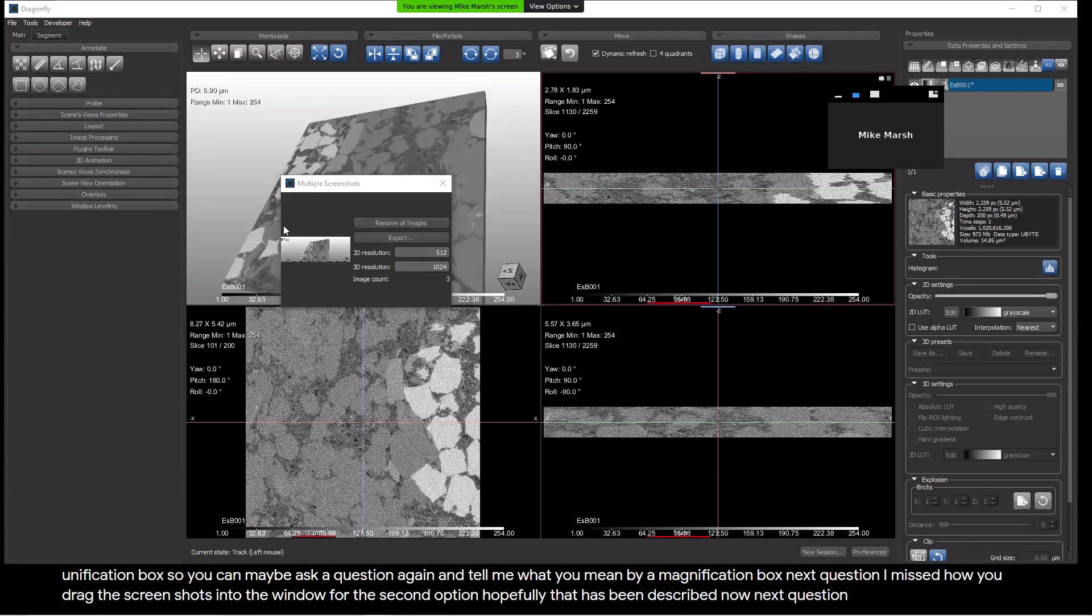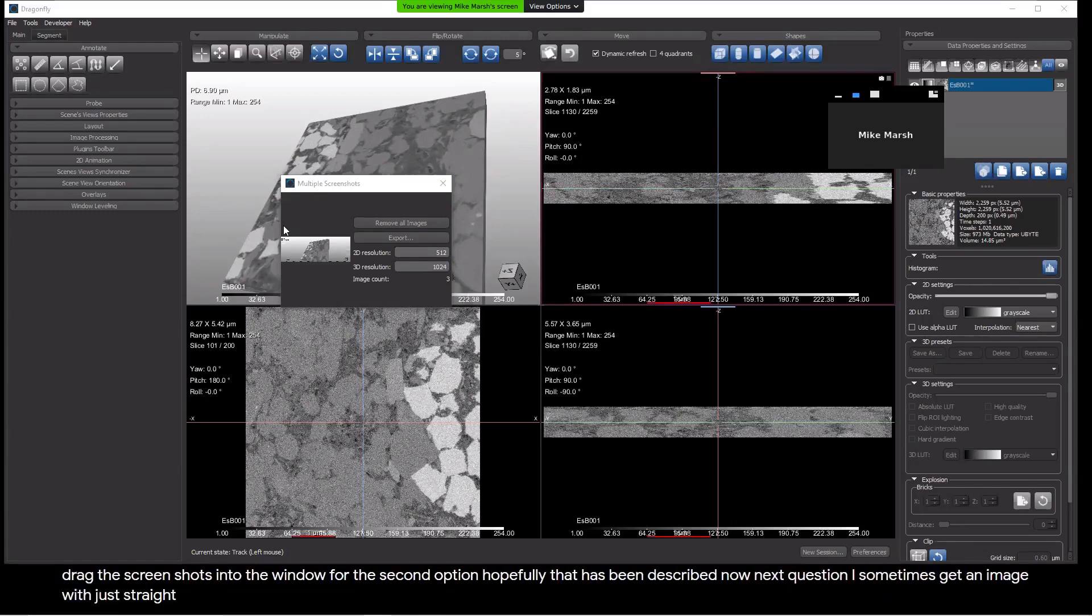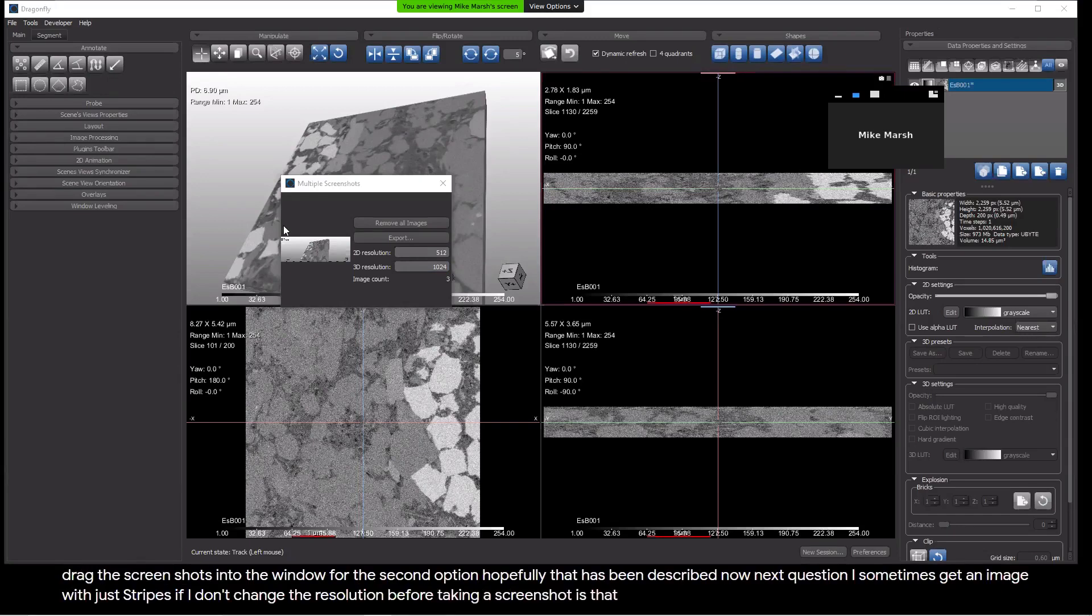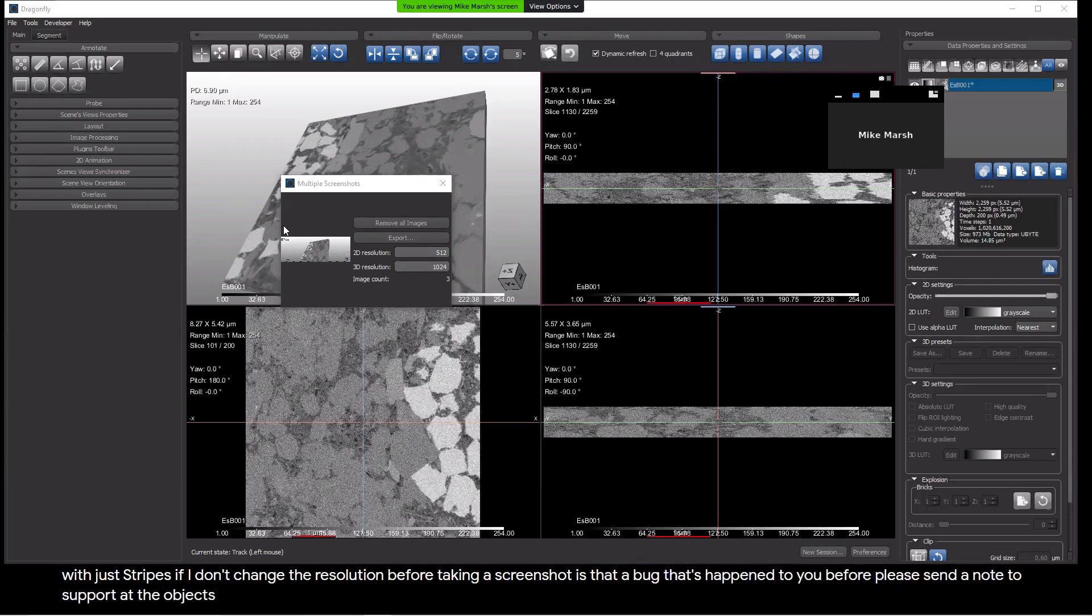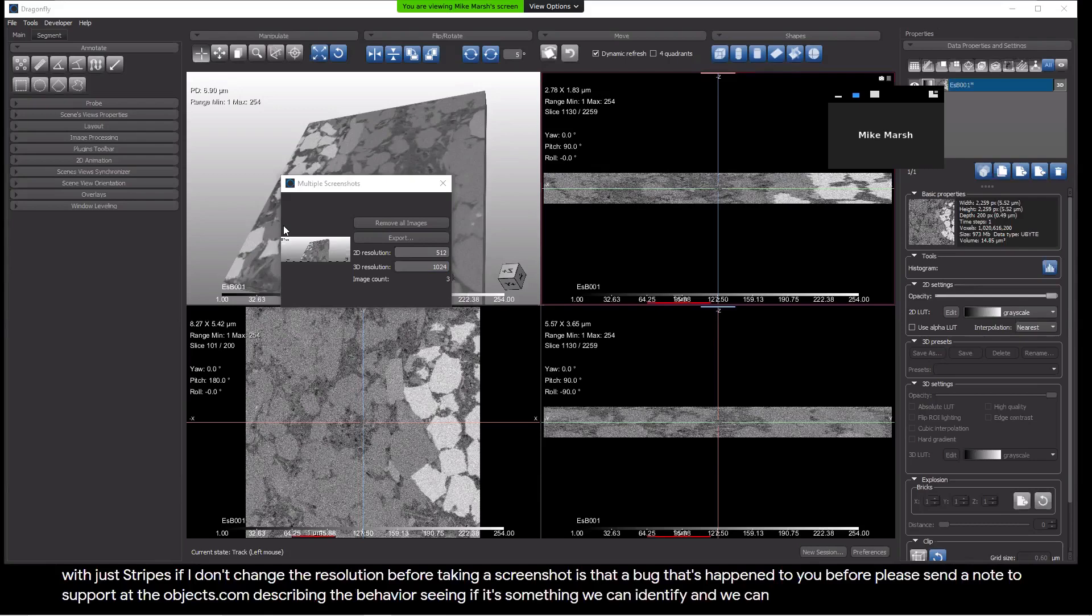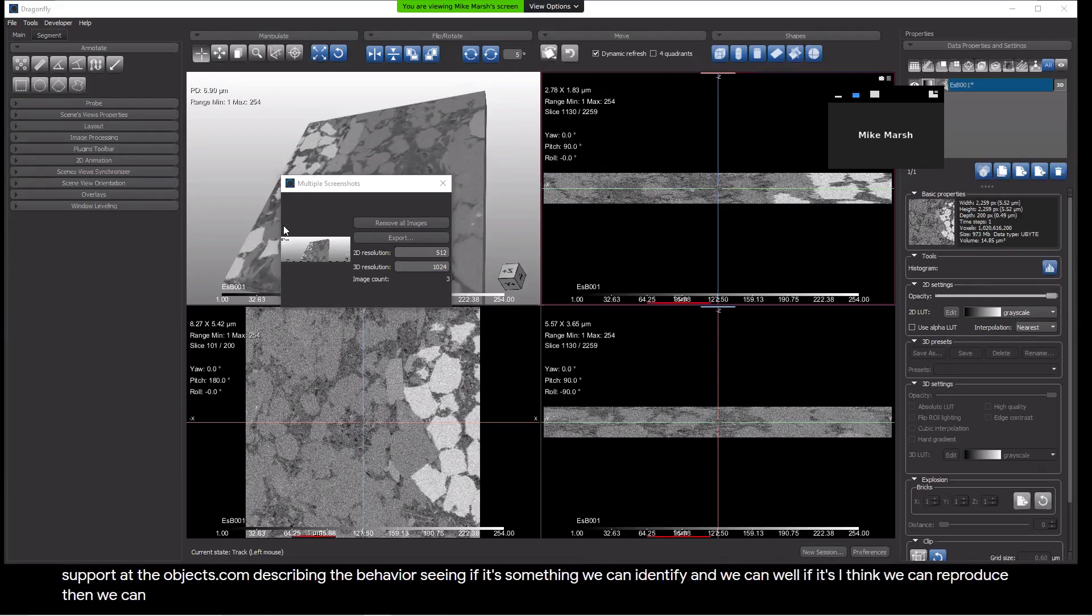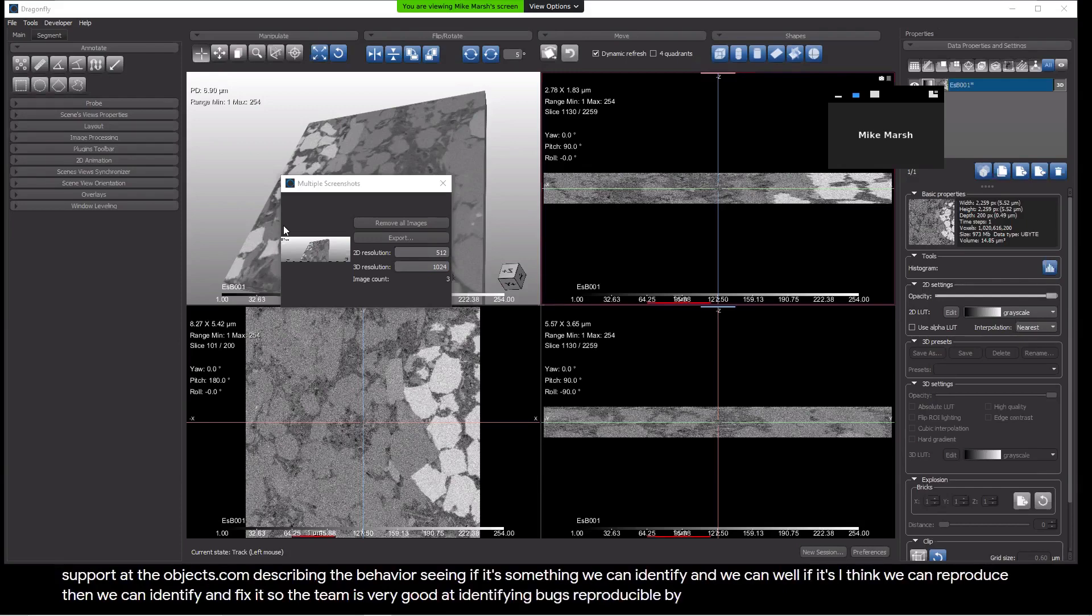Next question. I sometimes get an image with just stripes if I don't change the resolution before taking a screenshot. Is that a bug that's happened to you before? Please send a note to support at theobjects.com describing the behavior you're seeing. If it's something we can identify and we can reproduce, then we can identify it and fix it. So the team is very good at identifying bugs, reproducible bugs, and fixing.